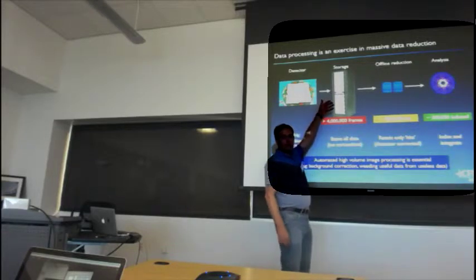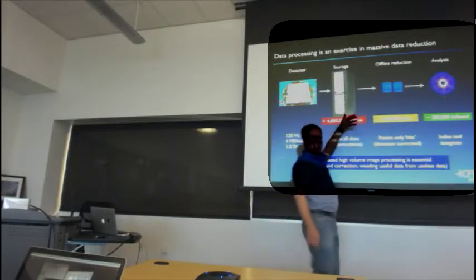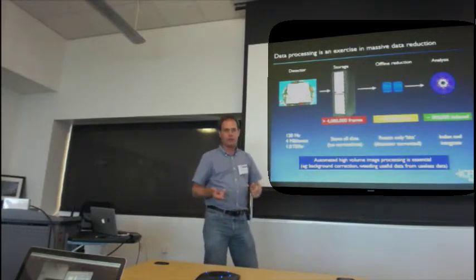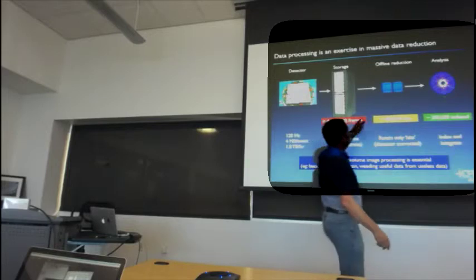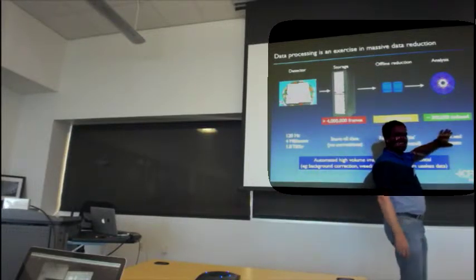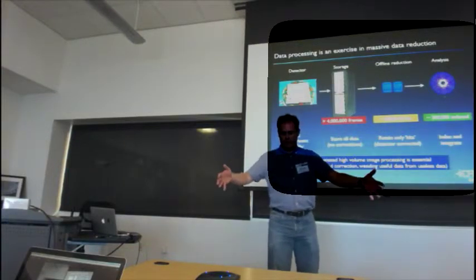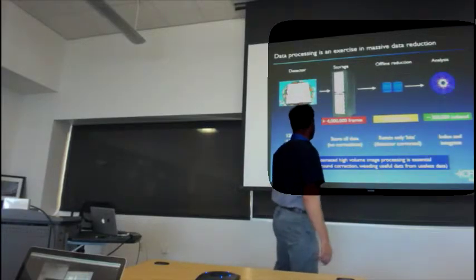This data is stored uncorrected, which is great because it means that if there's a stuff up in your calibration, you can go back and fix it later. But down here, for the analysis, you want all those corrections applied. So not only do we do the hit finding, we know where the bad pixels are, we know what the common mode offsets are, we know when 2 gain modes were used and apply the corrections for that, and spit out, as part of this offline reduction, as much detector correction as possible, knowing where the bad pixels were, so that when you get down to Tom and Nick's software here with the indexing and integration, you have something that looks like, here's a bunch of detector-corrected data containing only the crystal diffraction, and I'm going to work on this to understand my software.